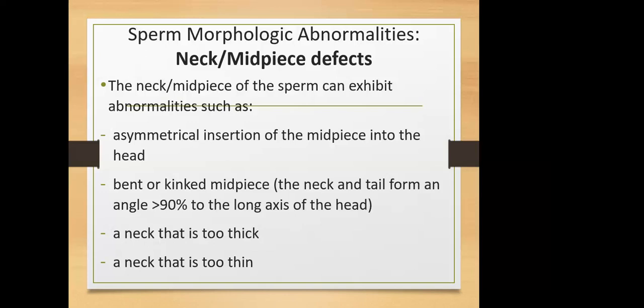All right. So if you have a tail, for that matter the neck to the head, if it is bent that sharp, then it is supposed to be kinked. And then, like we said, it's bent. So once it's bent, it means that it cannot move forward. All right. So that's it.